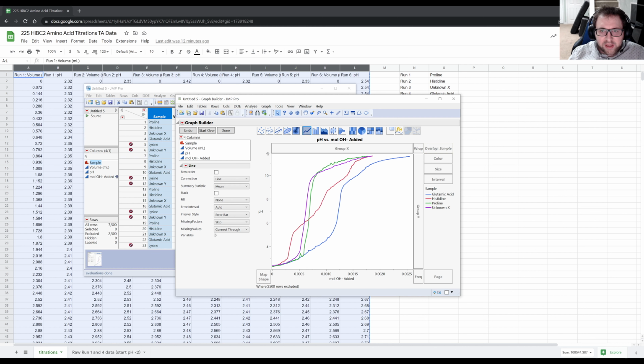If you shrink them before you export them, so like notice that I shrank it, it comes out like that. If I make this really big and then export it, it comes out really big over there, but the axis changes. So then if I want to make it the same size, suddenly I have to shrink it down, which makes everything smaller. So I really recommend shrinking things before you export them in JMP. All right. So this is one of the graphs we asked for. And this graph, not too bad to make.